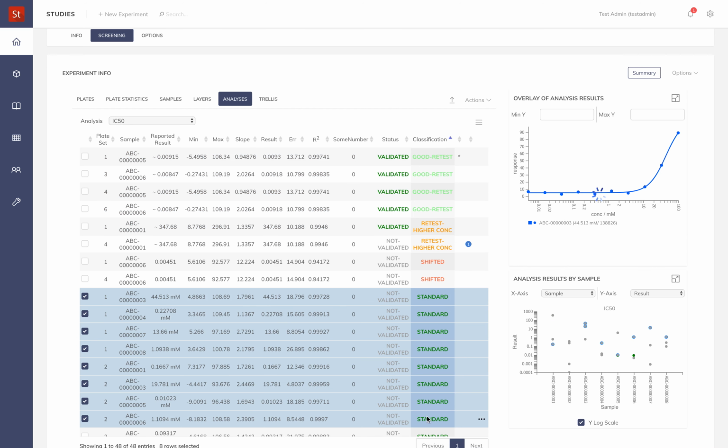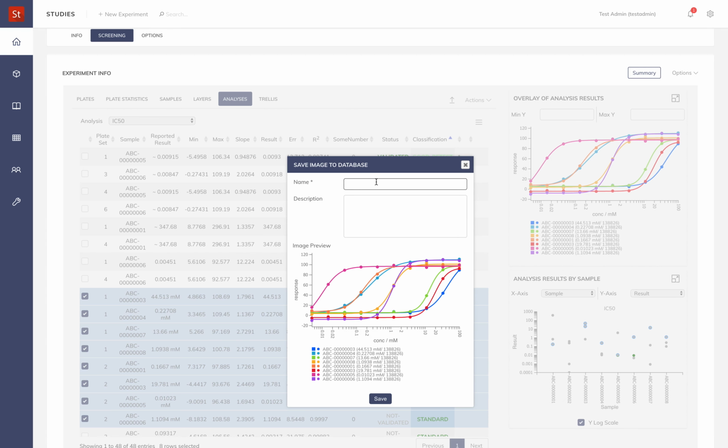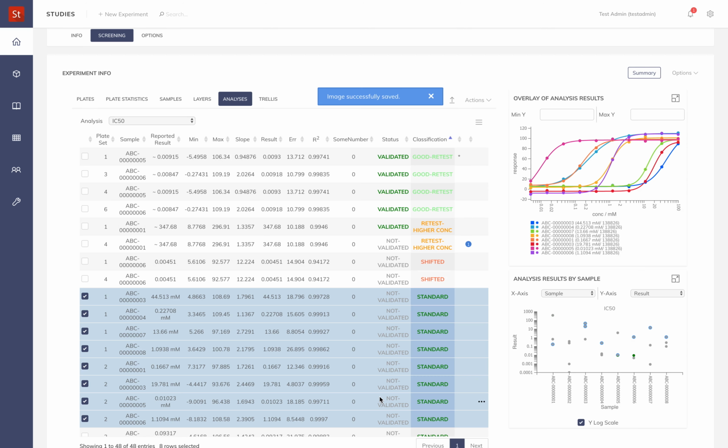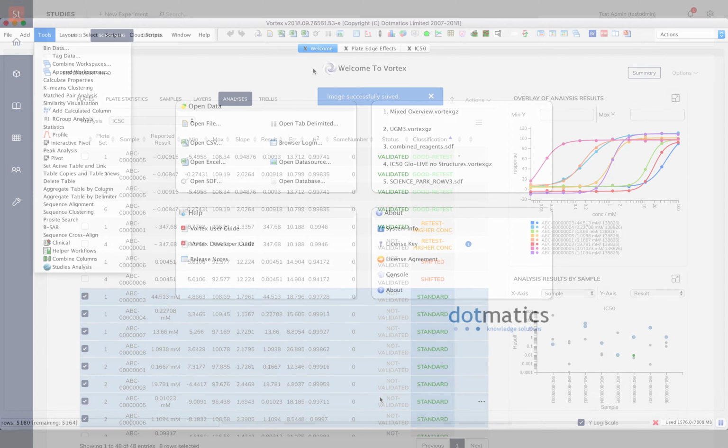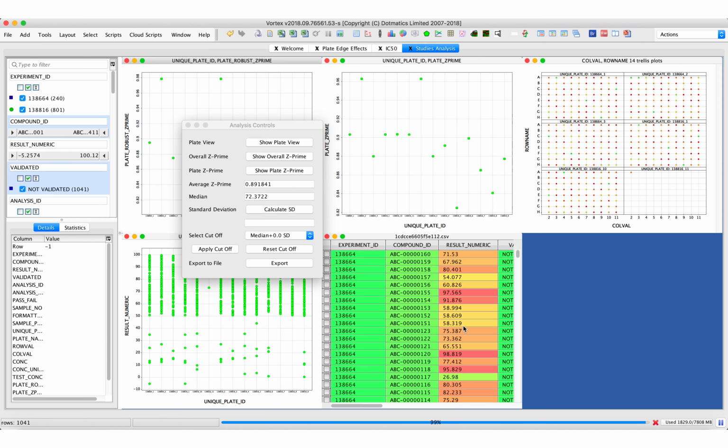Because these files have been standardized by TetraScience, the scientist does not need to perform any manual manipulations, ensuring there is no chance of transcription errors. Removing the time-consuming steps means that scientists can focus on a deep understanding of their results. For example, watch as we use Vortex to select a few experiments and dive deep into those results.